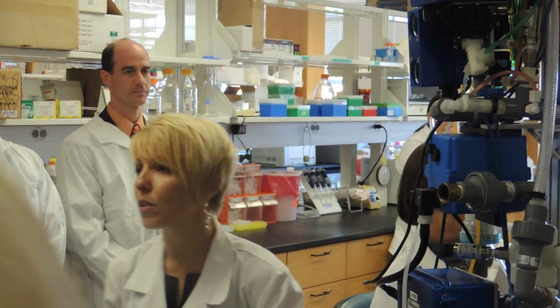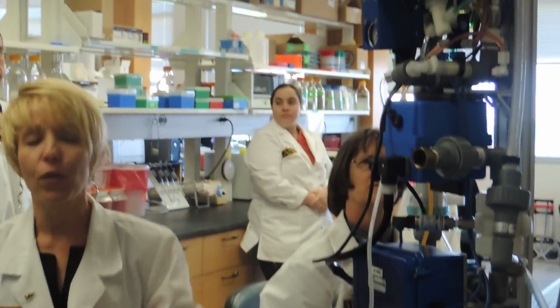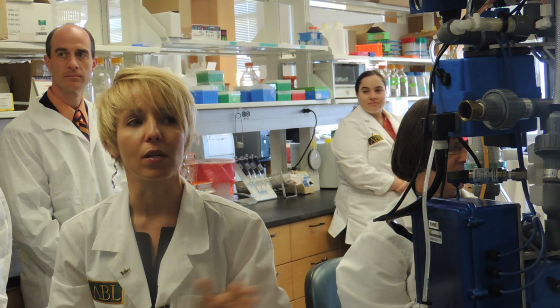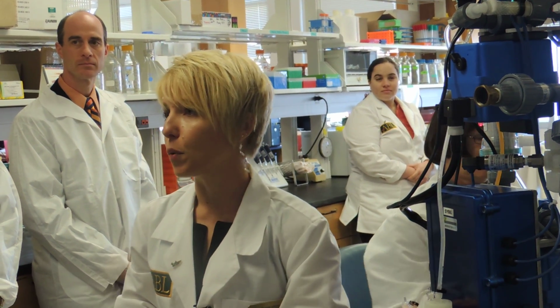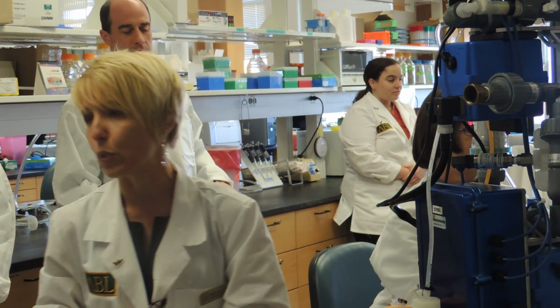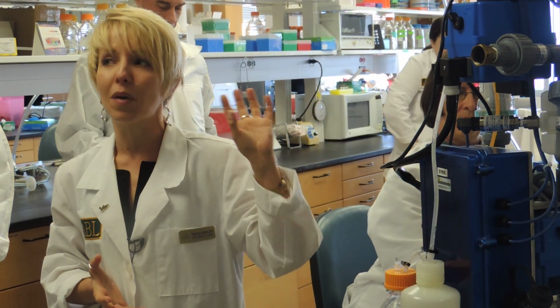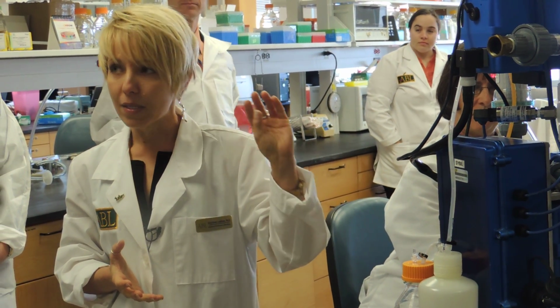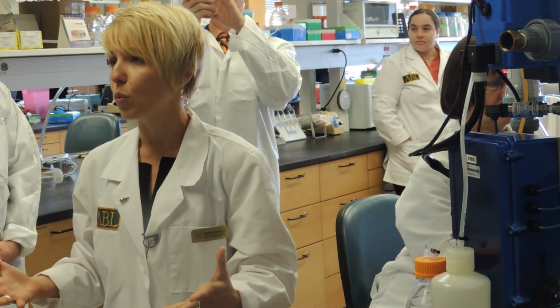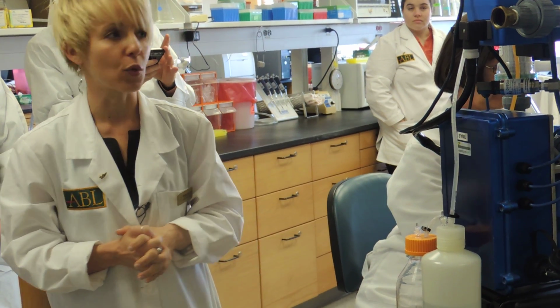And our units actually function in a different way than a lot of other groups use ultrafiltration. We were the first group to actually use dead-end ultrafiltration, which means that we are single passing the fluid through the filter instead of the recirculated mode that a lot of the CDC and EPA labs have used in the past. What that allowed us to do was to make this much simpler, much more portable. You don't have to have a collection reservoir to recirculate that fluid through that the tangential methodologies require.